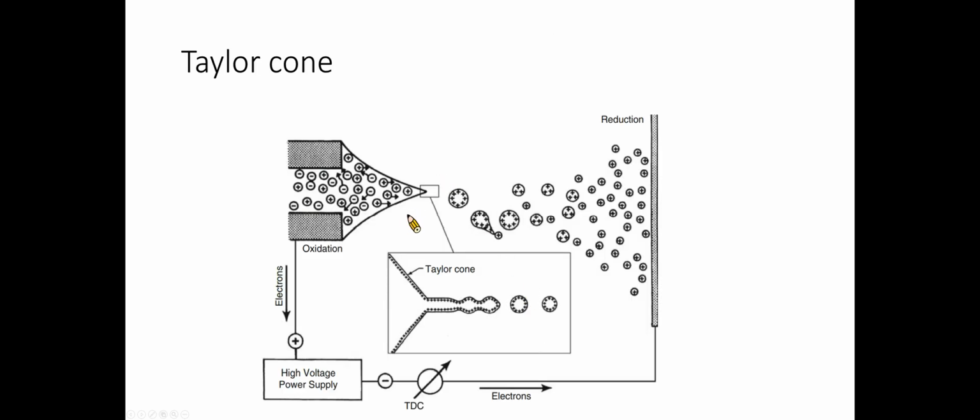The accumulated charges, positive or negative, will be repelled by the high voltage capillary of the same polarity, and then they would drift towards the liquid surface at the capillary outlet. However, the accumulated like charges at the surface are destabilized, and finally the meniscus will be drawn out and deformed into a cone under the influence of a very high electric field.